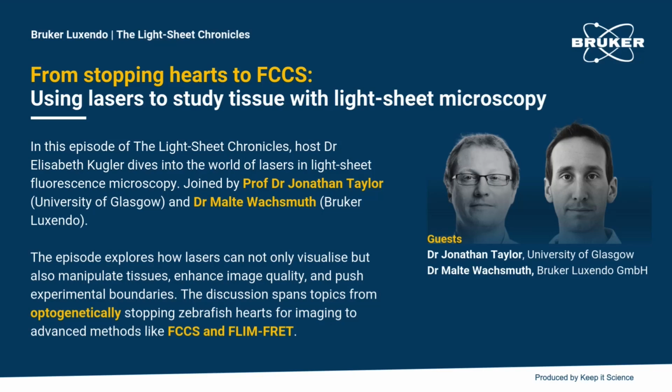We talked about the things we can do with light sheet lasers, including how to influence artifacts, adopt application-specific beams, and use lasers to manipulate tissues. Huge thanks to our listeners for tuning into this episode of the Light-Sheet Chronicles. And in our next episode, Image Analysis in Light Sheet Microscopy, we talk about big data processing, handling, and storage.